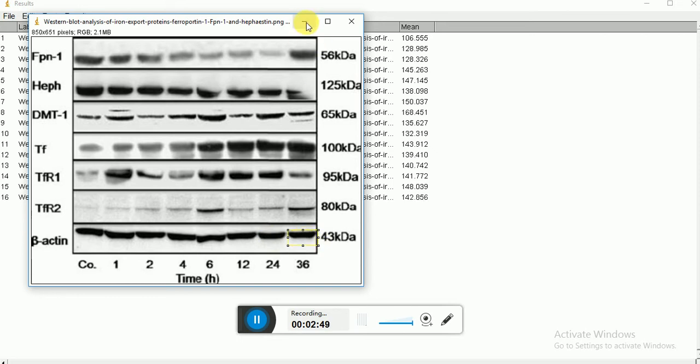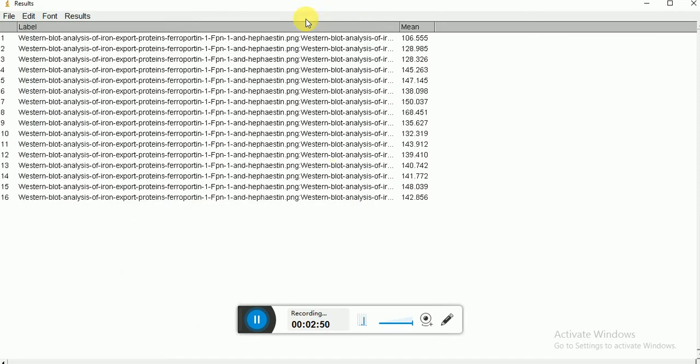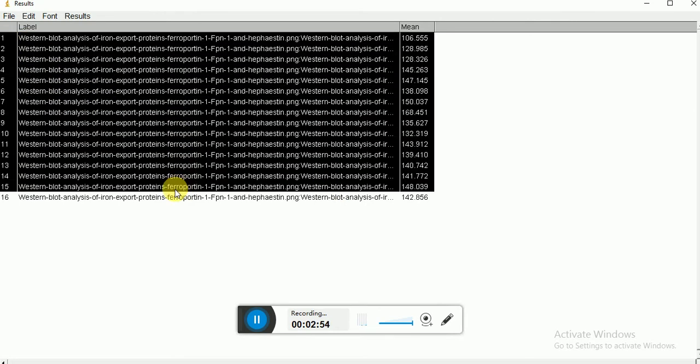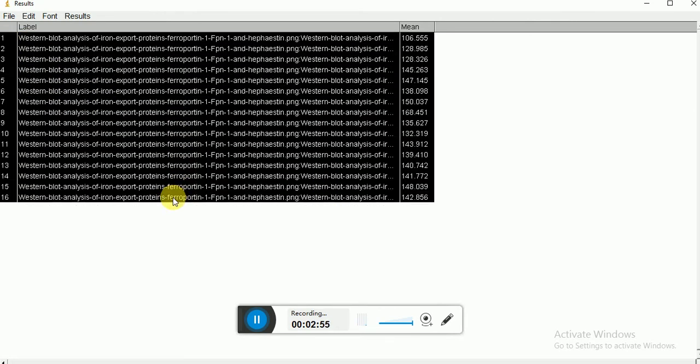Now the role of ImageJ is over. So how to calculate this ratio? Just copy this data to your Excel sheet.